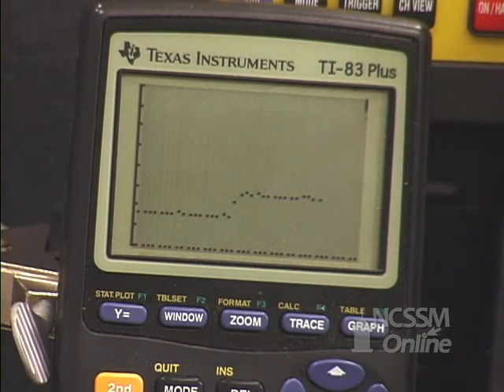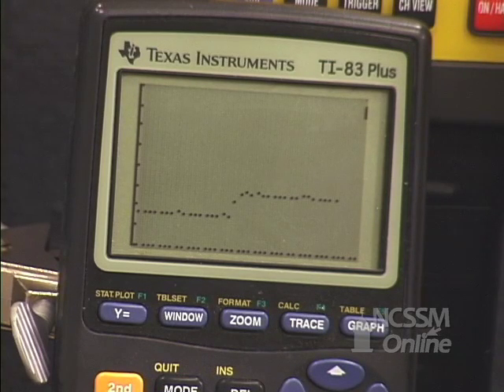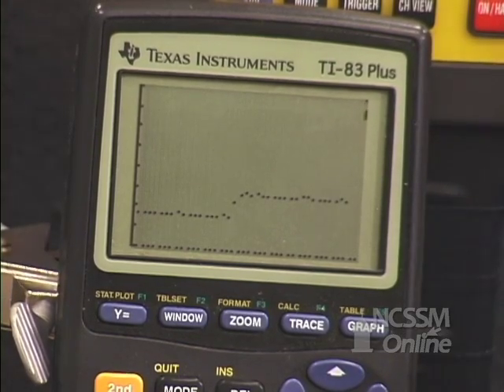Eventually, an equilibrium is reached between the methanol liquid and the methanol vapor and the pressure will level off. The difference between the initial pressure and the final pressure gives the vapor pressure of the liquid methanol at this temperature.